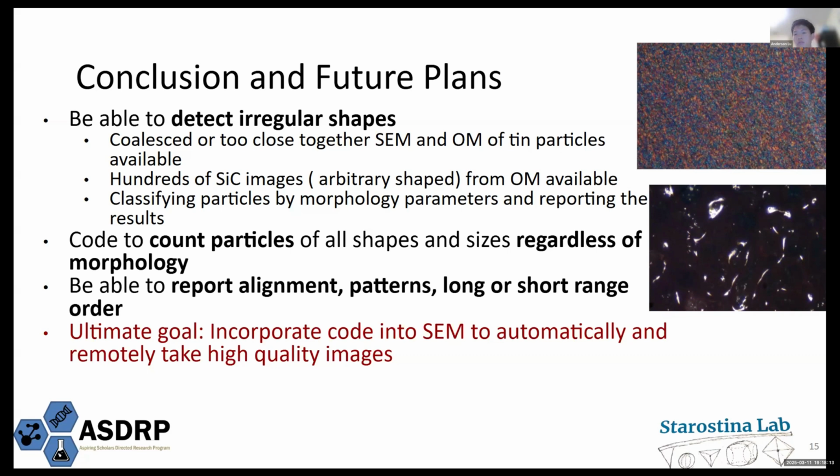So if we want to do that, we have to define a standard for considering particles, while also we need to finish up and solve the issue of misidentifying particles in SEM images.